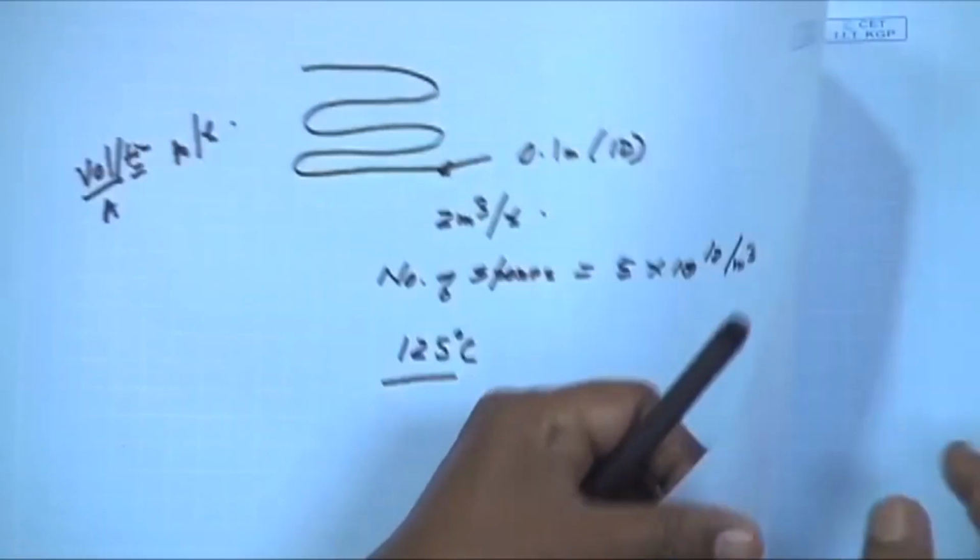Now let me show you how we can transfer the culture, because we now have the information on how media can be sterilized and how air can be sterilized. What remains is the culture we prepare in the lab, which is to be aseptically transferred into the inoculum vessel.